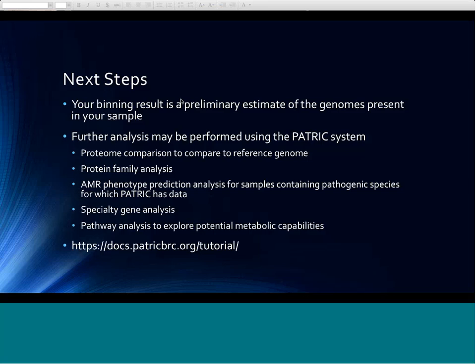Okay. There's 2 questions I'm going to sort of wrap into one. The binning algorithm sounds similar to the Midas algorithm. Do we have a comment on that? And the second thing that's related is, have you done an assessment of your binning tool versus others, such as Midas? Have we benchmarked against Midas, I guess is the question. Yeah. I think the answer is no. Okay. So at this point, we have not.